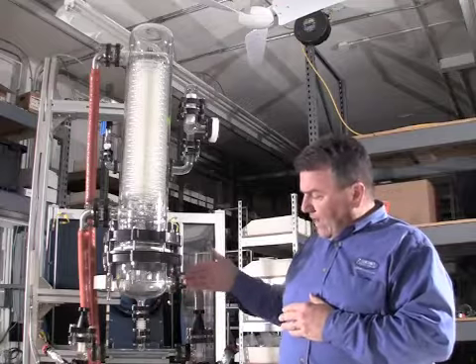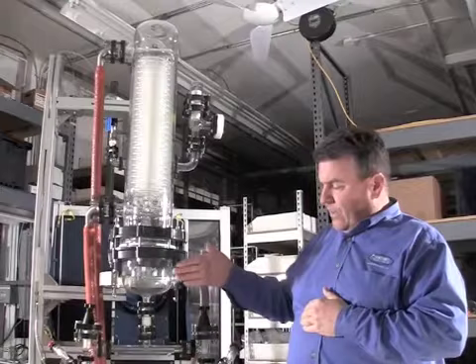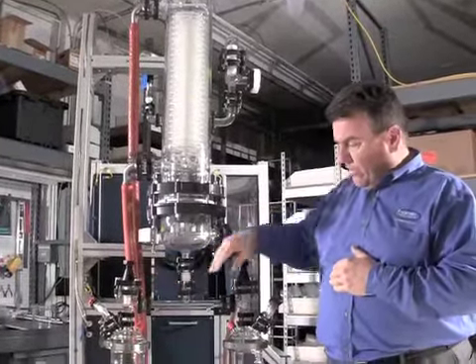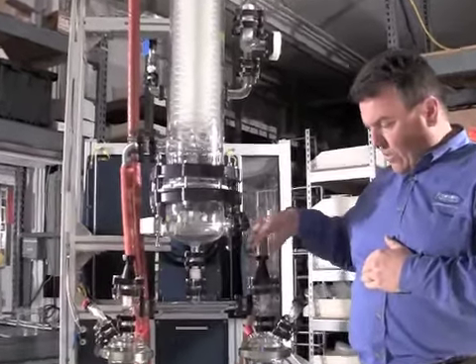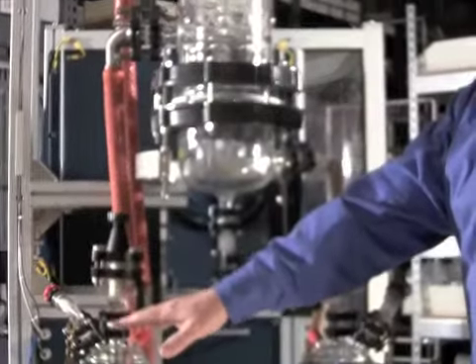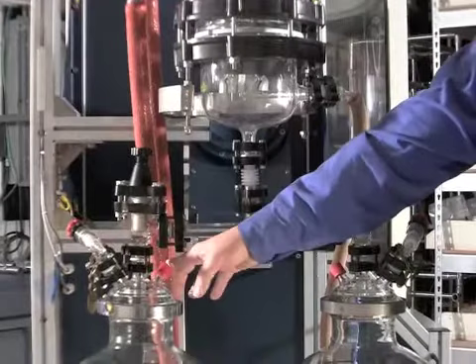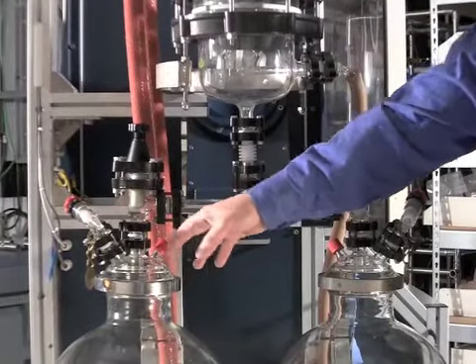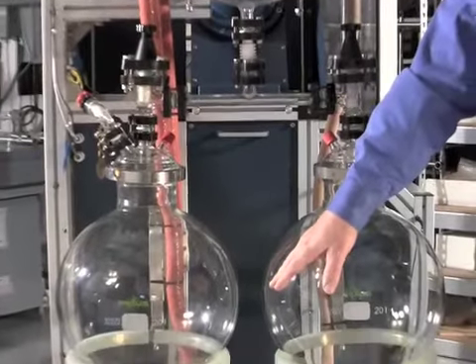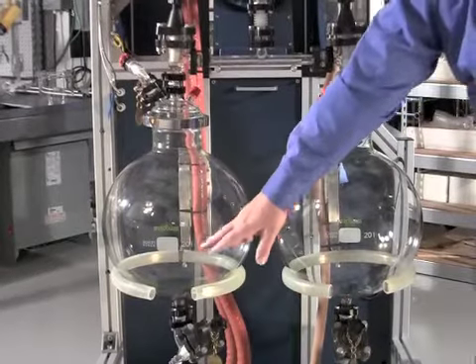Here you see where the vacuum is applied. Once we go into the receivers, we can control them individually with these valves — as one fills up we can take it offline and drain it. The caps of the receiving vessels also have a valve and a secondary port which is capped off. Underneath, the drain valves allow everything to be metered as all vessels are graduated.